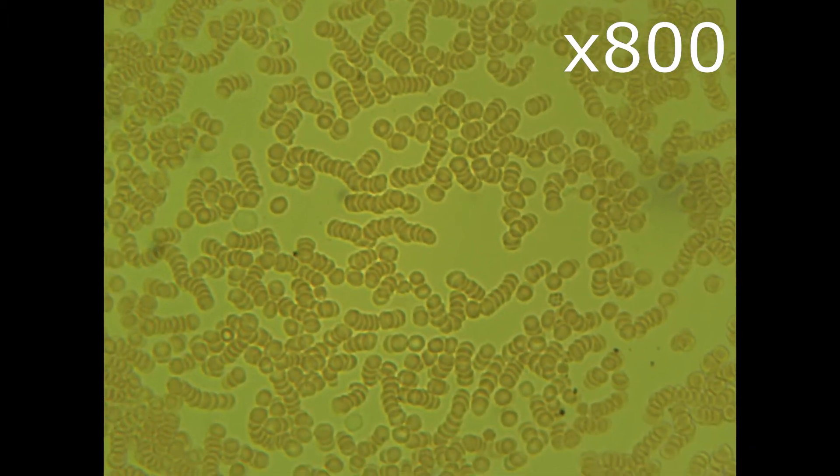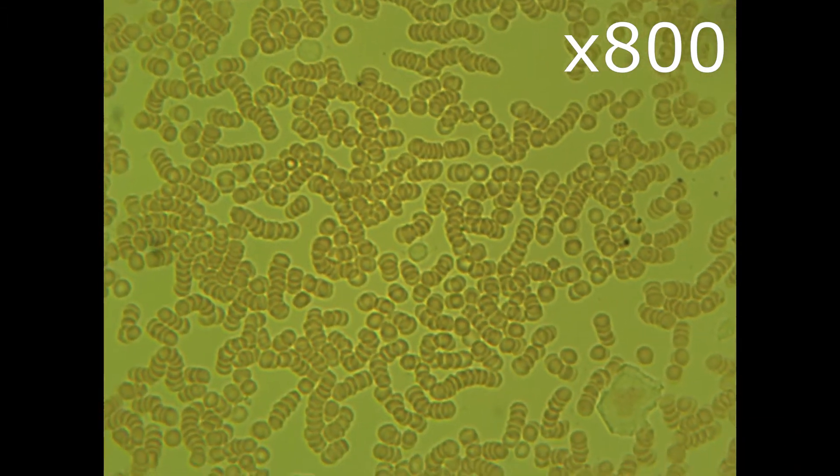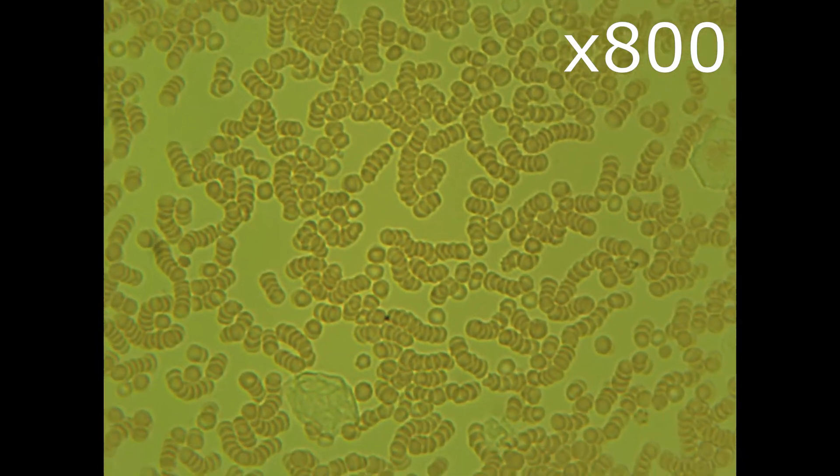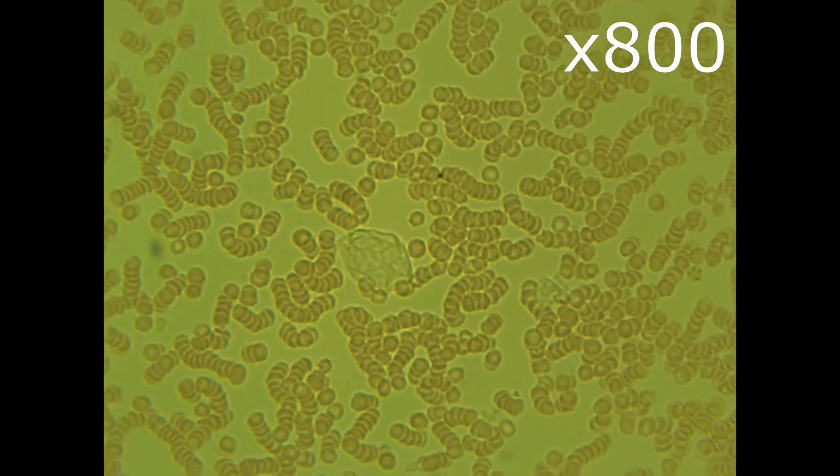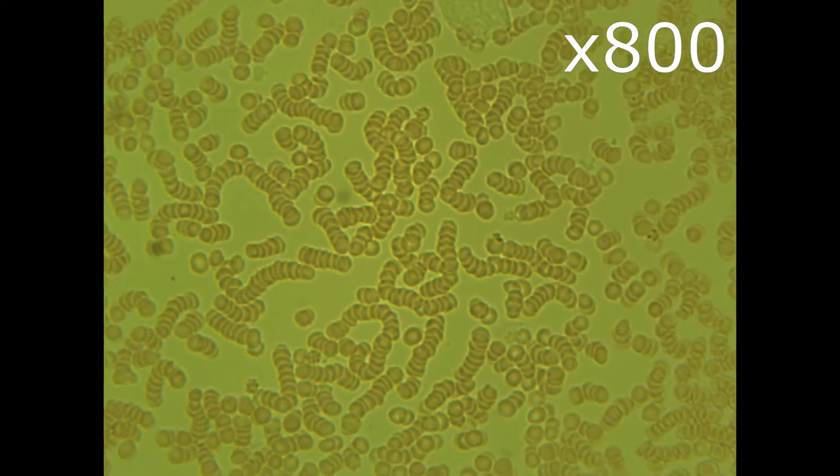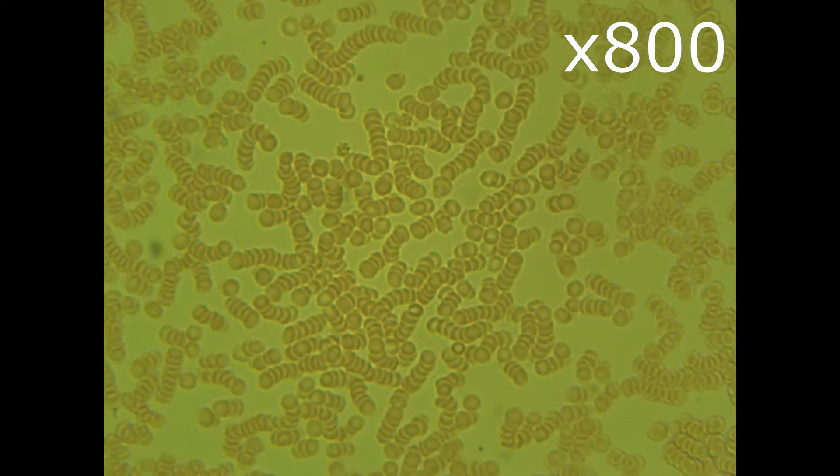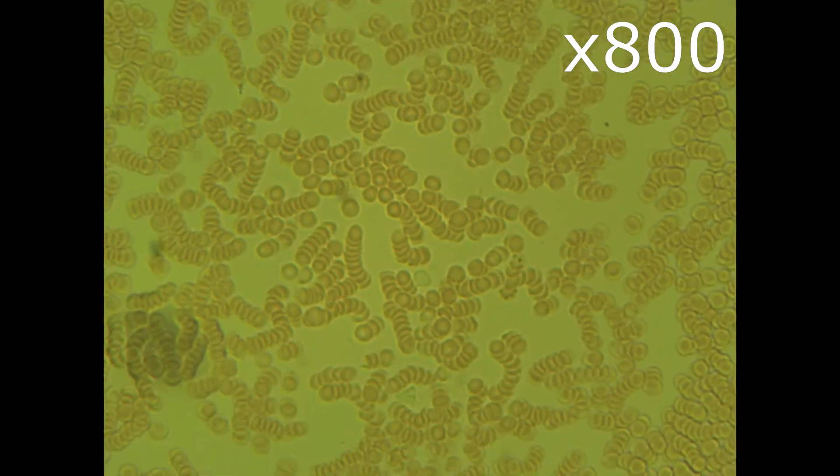Let's have a closer look, zooming to 800. Definitely, there is no noticeable change. I am covering larger area and we still can see long chains of red blood cells that looks like a worm. It also looks like the space between them slightly increased.